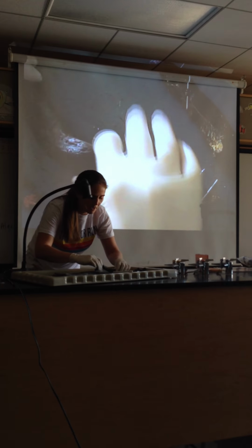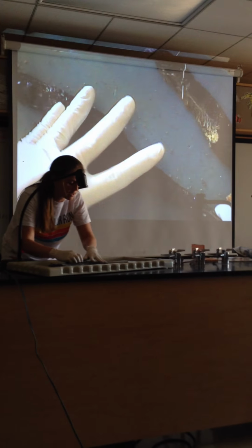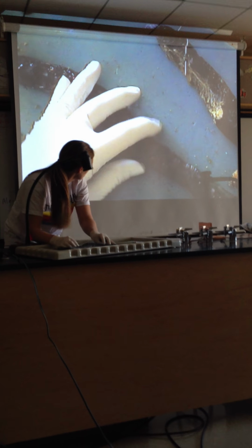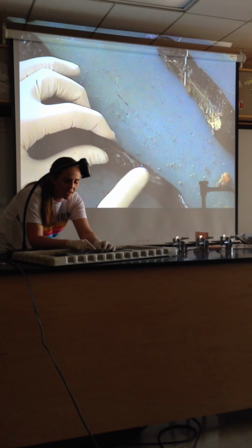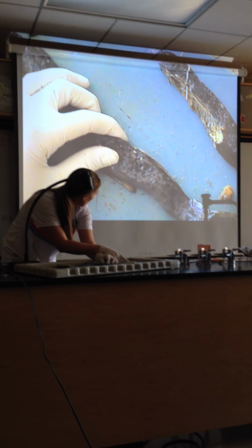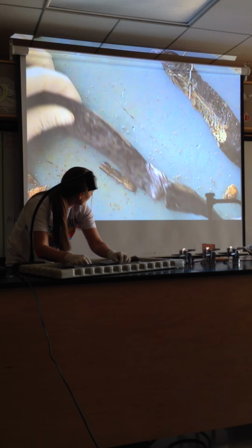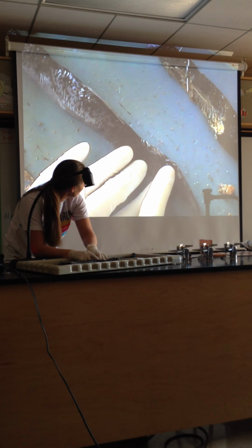All right. If we continue down the lamprey, and the lamprey is located on its ventral region, you're going to notice two sets of dorsal fins. We have the anterior dorsal fin because it's located closer to the front of the body. And then if we move further down, you can see where the slit is. This is the posterior dorsal fin.